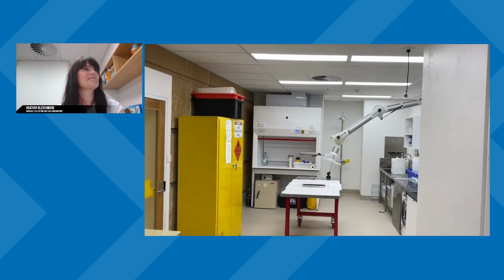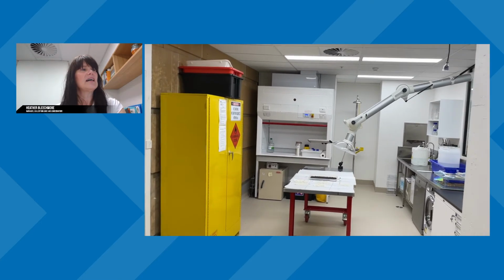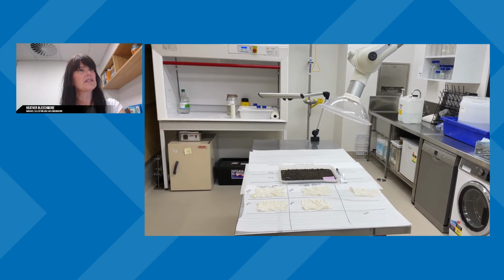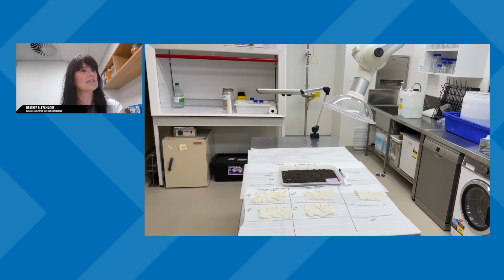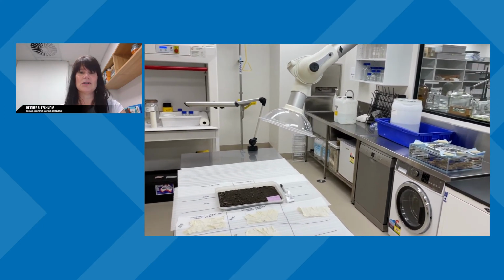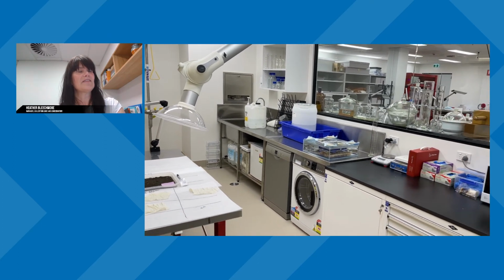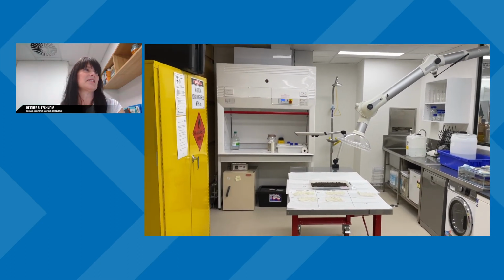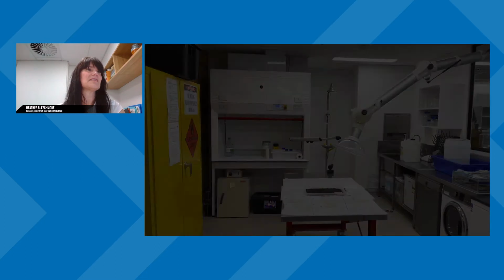Behind that area is our new wet lab, where we do all our solvent work. We have an extraction arm for use, which is hovering over that table there, and a fume cupboard in the back for a lot of our solvents work. And on the table here, you can see an example of some of the testing that we do. This is an adhesive testing grid for various concentrations of adhesive film for a consolidation treatment. The other equipment that you can see in the lab are fairly domestic. There's a fridge, there's a dishwasher, washing machine, microwave. I think we've also just zipped past some herpetology specimens in a wet box. And over to the left is our dangerous goods cabinet where we store all our solvents.